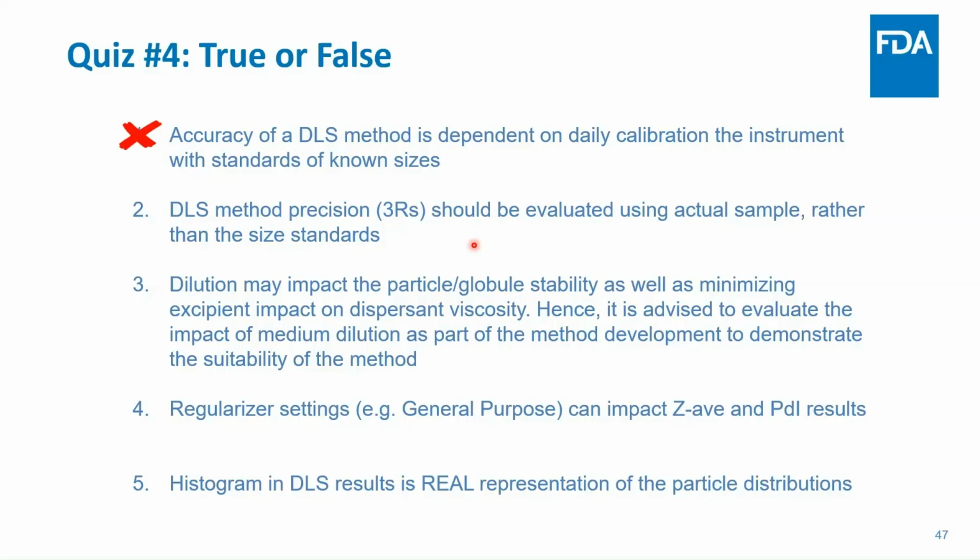So it's always nice to have a standard run, but you don't use a calibration curve. You don't prep a bunch of standards and compare your results to measured standards. So you never do calibration. You can use a standard as a reference for your system, but it's not important for actually measuring the size of other particles.